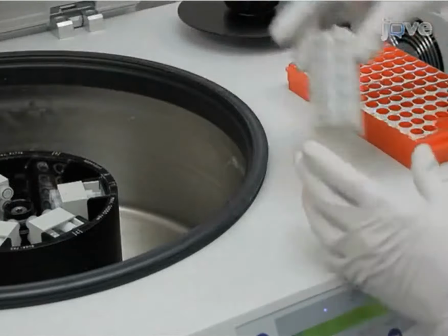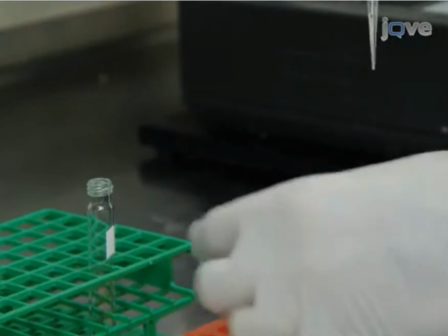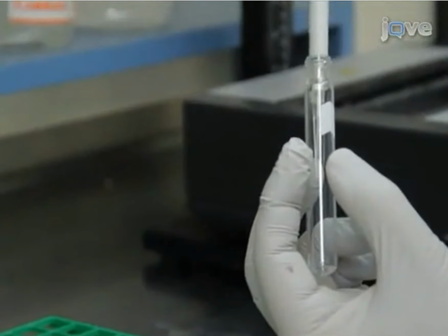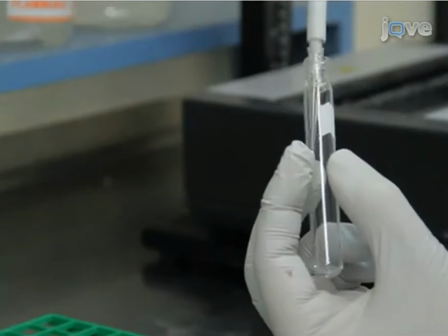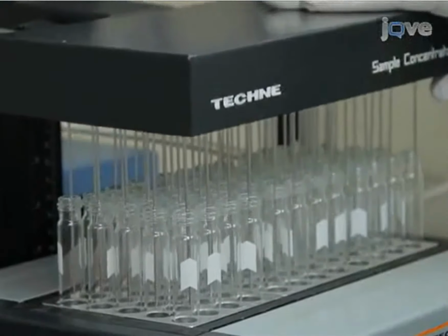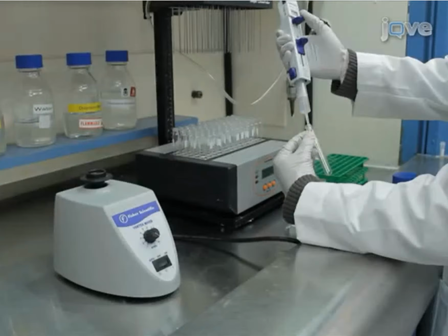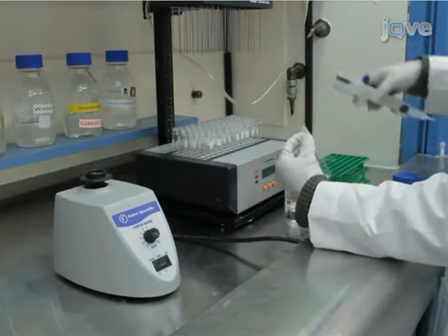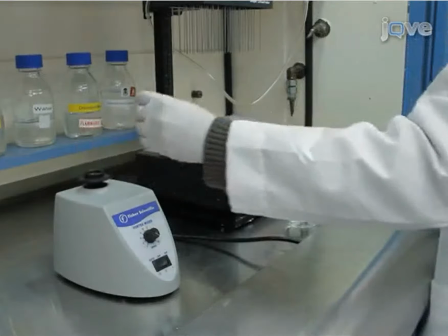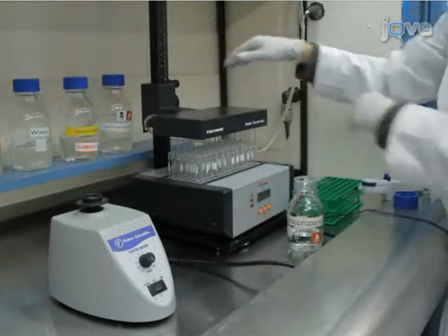Transfer 100 microliters of the acidic supernatant containing the solubilized sugars of the matrix polysaccharide to screw cap vials, making sure not to disturb the pellet material. The pellet can be used for the crystalline cellulose assay. Evaporate the TFA in a glass tube under a gentle stream of air in an evaporation device. Add 300 microliters of 2-propanol to remove excess acid, vortex, and evaporate at 25 degrees Celsius. Repeat for a total of 3 times.